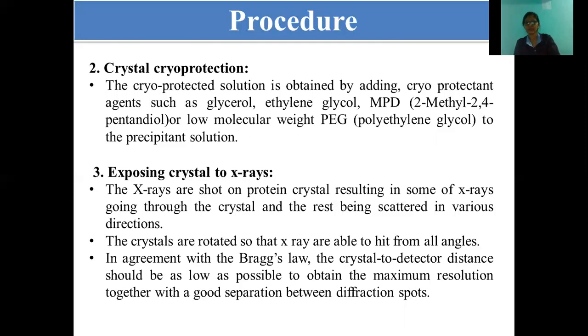Because when the crystal is exposed to the X-ray beam, it will get heated. Continuously exposed to the X-rays, it will get heated, and to avoid overheating of that crystal, liquid nitrogen flow is used to cool down that crystal.